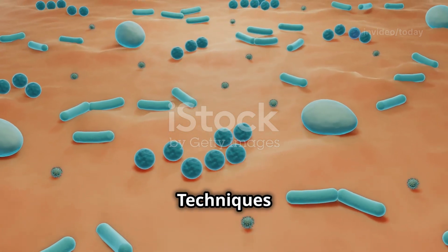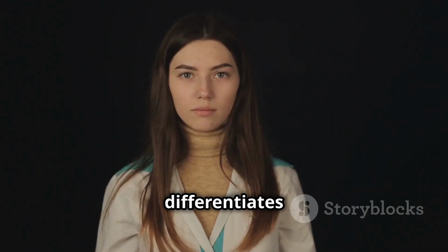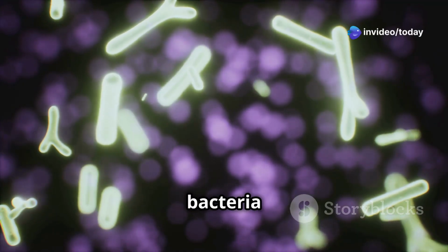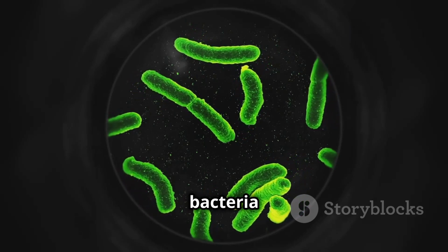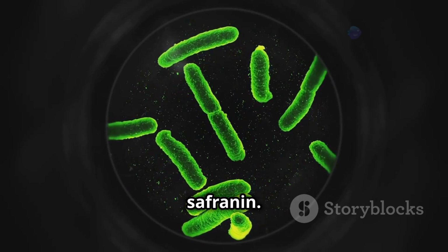Common staining techniques. Gram stain. This is the most widely used staining technique. It differentiates bacteria into two major groups. Gram-positive bacteria. These bacteria retain the crystal violet stain and appear purple under the microscope. Gram-negative bacteria. These bacteria do not retain the crystal violet stain and appear pink or red after counterstaining with safranin.